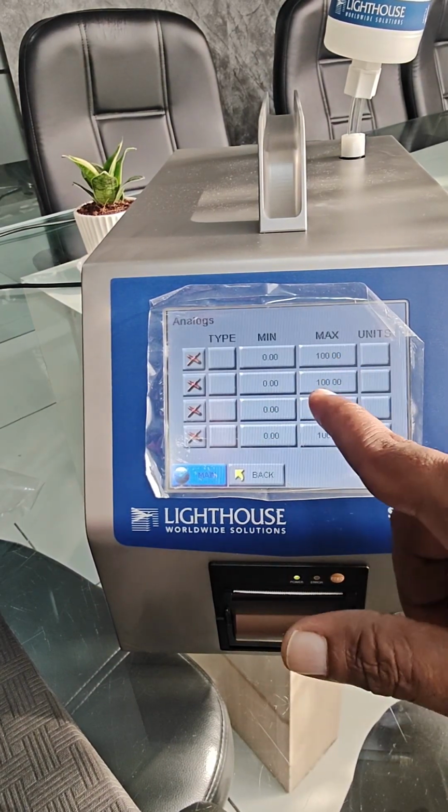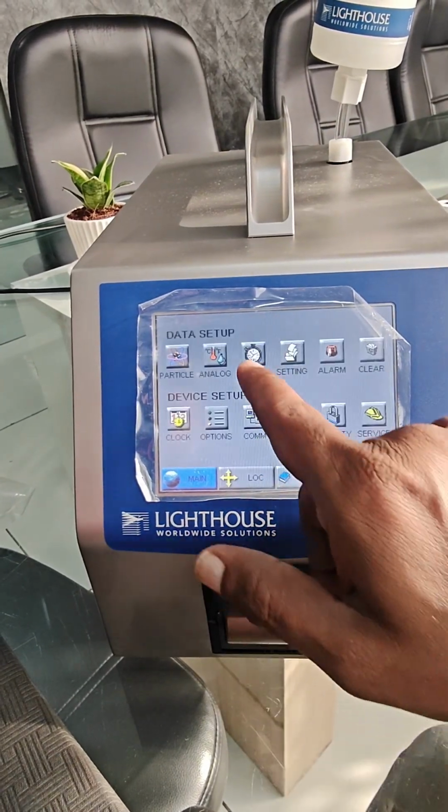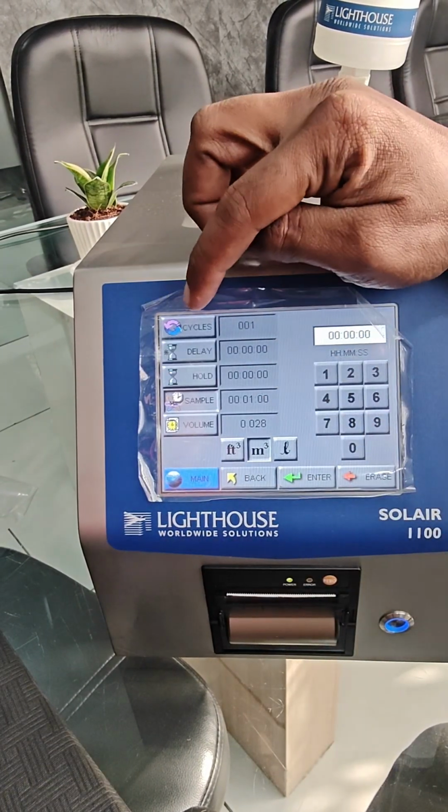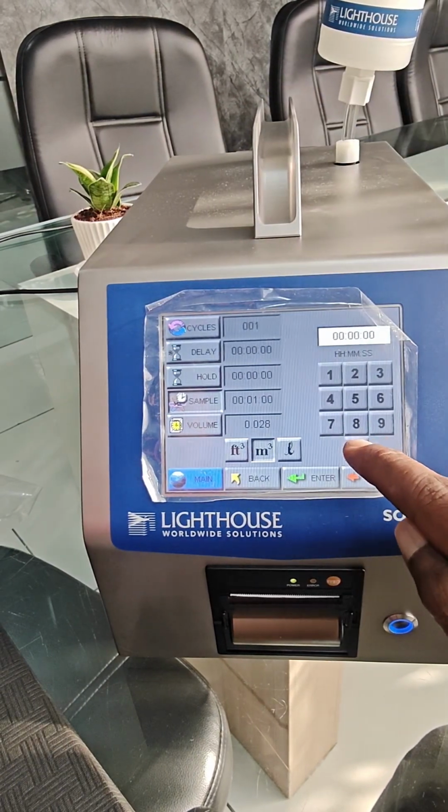This is temperature, humidity, analog channels. This is how many number of cycles you want.